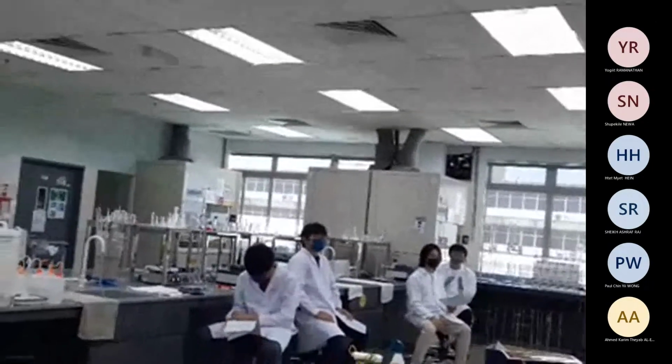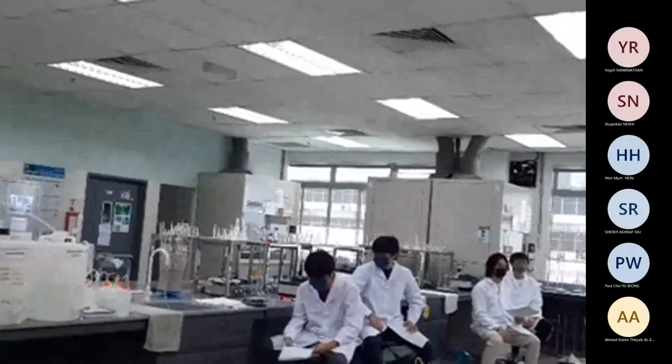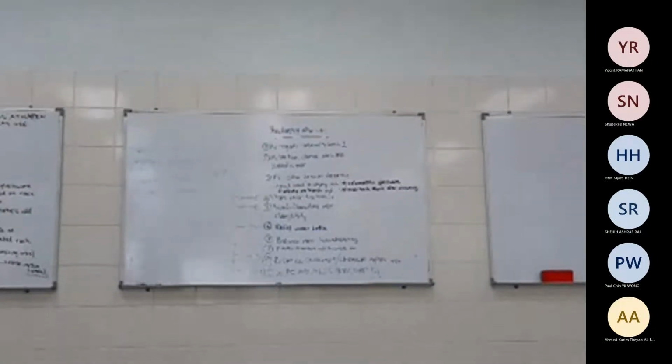What is the tool that you will be using to produce a calibration curve? A graph, right? Yeah, that is the thing. A graph you will take. I don't know if they can see or not. They'll say that is too far. Okay, you can see. Later I'll bring it.